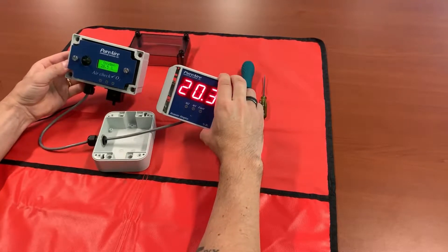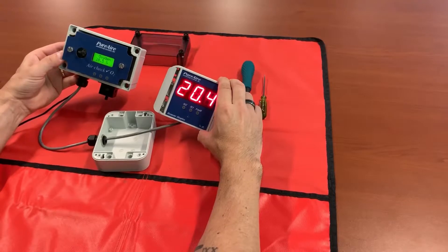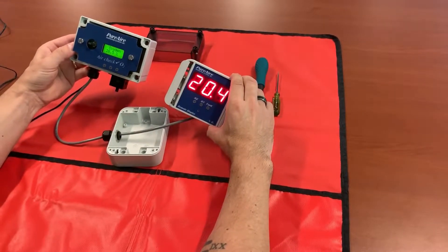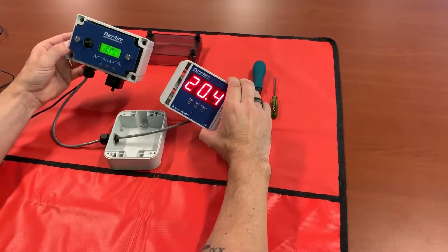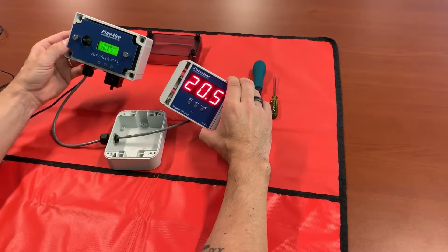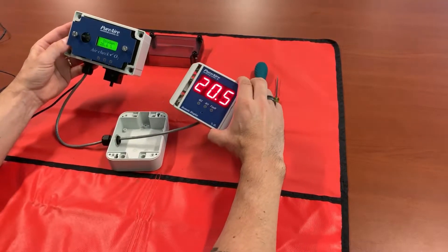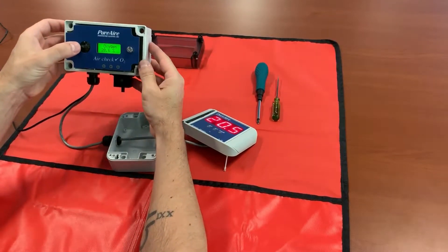Now that our monitor has timed out, you can see the monitor is reading 20.5 and our remote display is reading 20.4, maybe toggling down to 20.3. At this point we need to go ahead and adjust our span and zero to our monitor so we can get them synced up. The first thing we have to do is enter our password on our monitor.